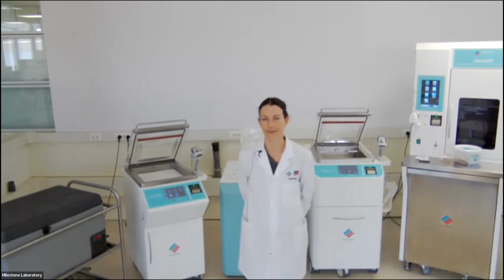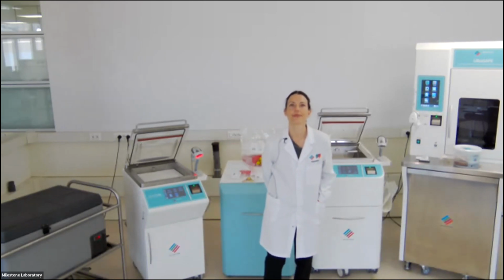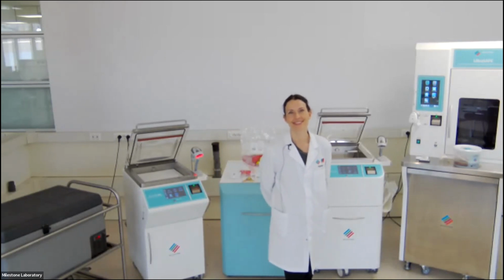Thank you again. We are actually receiving a lot of questions. Let's do a few more. What is the minimal size tissue that is possible to be used with the Tissue Safe or Seal Safe?